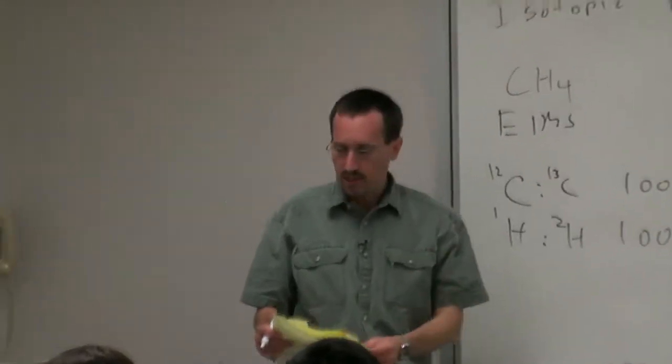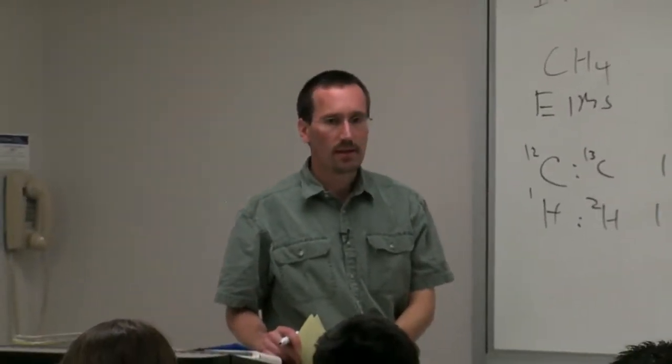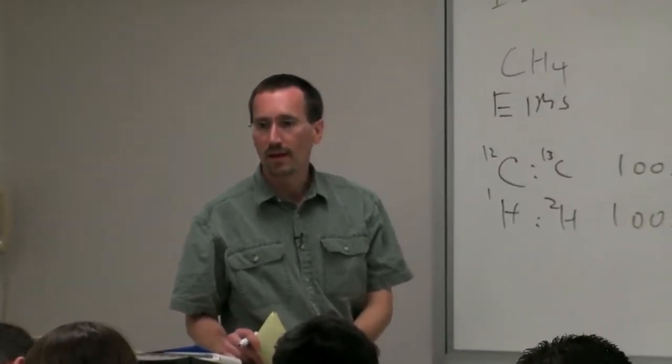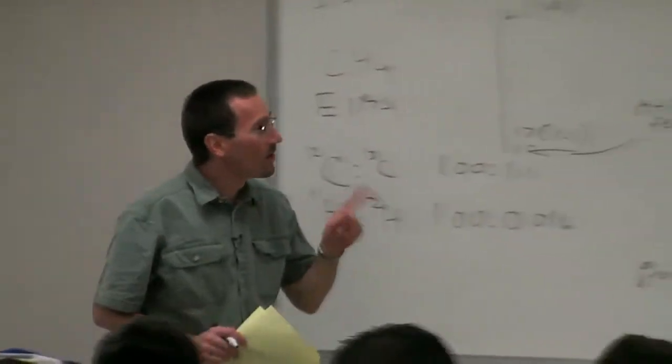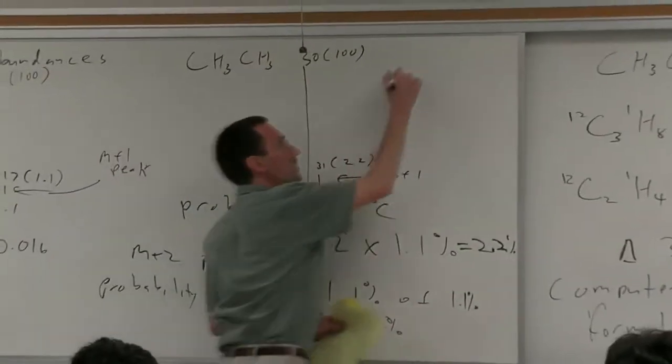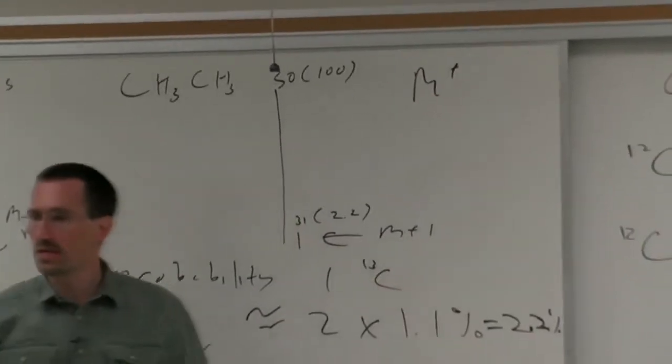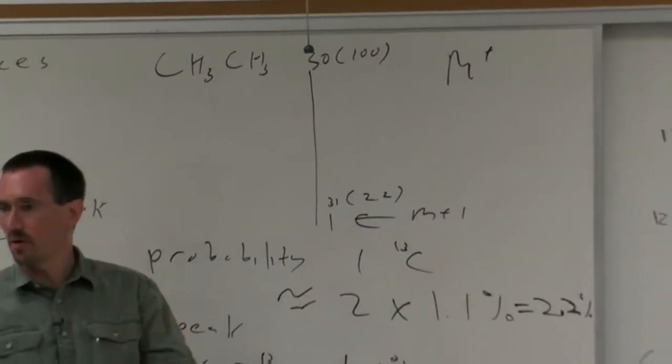Thoughts or comments at this point? So is the peak that's M plus, is that always going to be the highest? No. Okay, great question. The peak that you call M plus is going to be the lowest isotopomer peak.